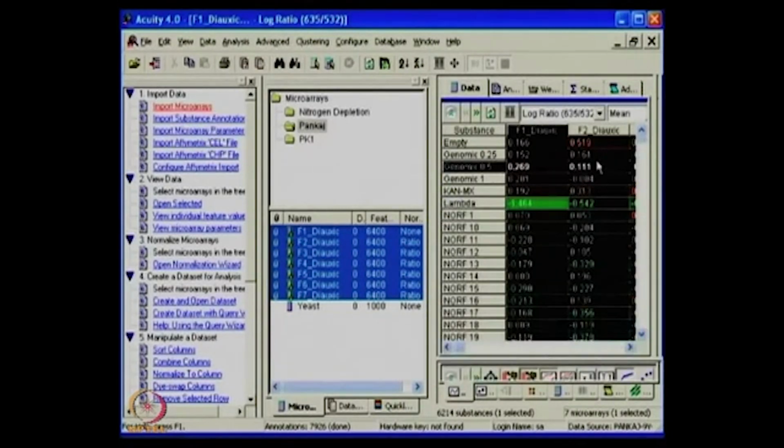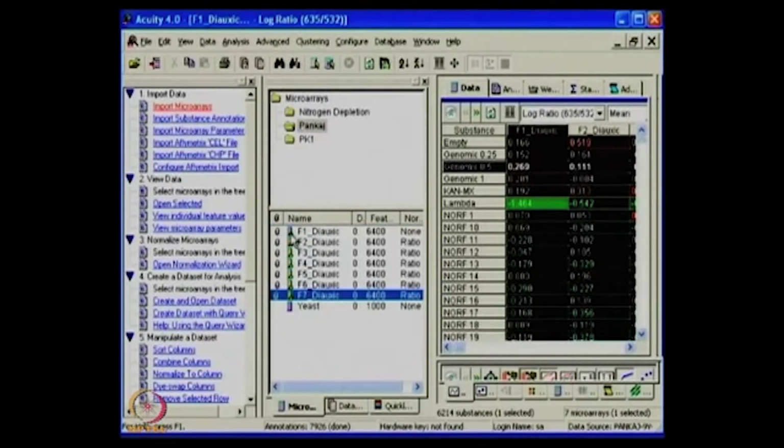Before going into this, let me explain an important factor here. What does each image mean? Sure. Actually, if you carefully look, it may not be very clear, but this is a little purplish in color and the other down ones are a little reddish in color. The purple one means that the data is not normalized. The red color means that the data is normalized, and the little dot green color what you are seeing tells me that I have a JPEG image which I can see down here. So it allows me a connectivity of what is happening just by visualization.